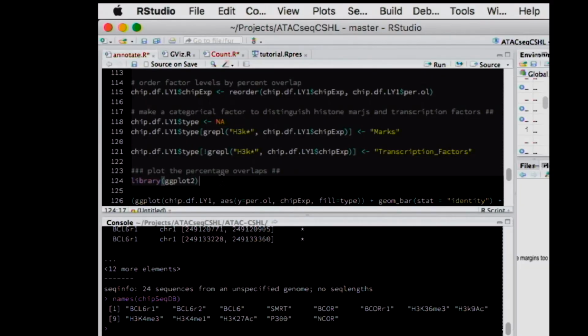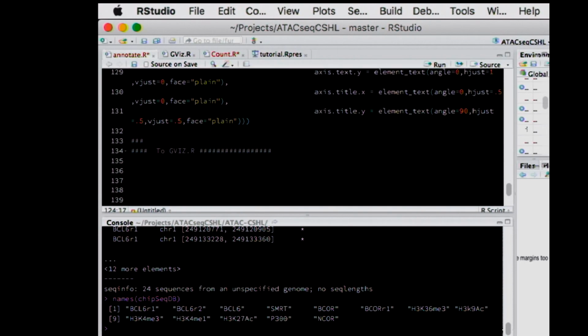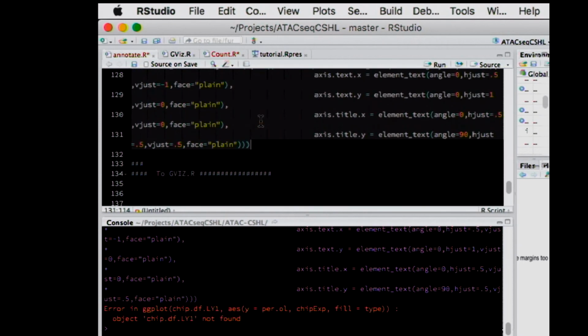Are variables categorical, and all this data science-y type stuff. So we're going through all that. I'm happy to talk more about it or answer questions, but let's execute down through the plot and see if it works.